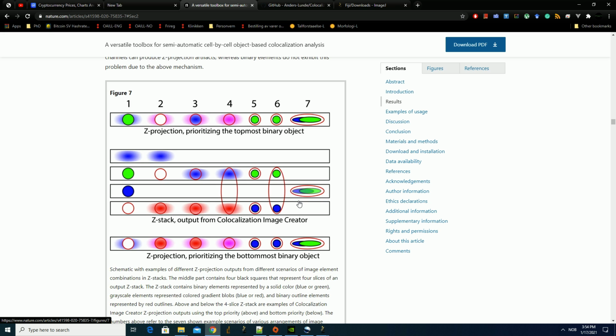So of course the problem with this is that you will not see some of your data, because you will not see those cells that are stacked. You will only see the topmost. You will not see the bottom or the ones that are under. But at least you will get an unbiased selection under some conditions and terms, of course, if you consistently choose either the top or the bottommost object to be visualized. And we will see in the example how this can be useful.